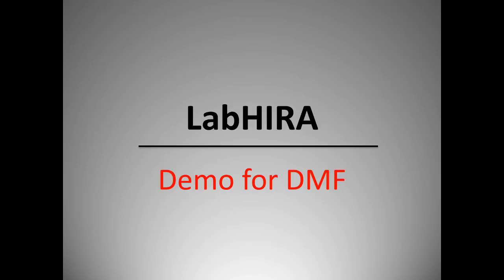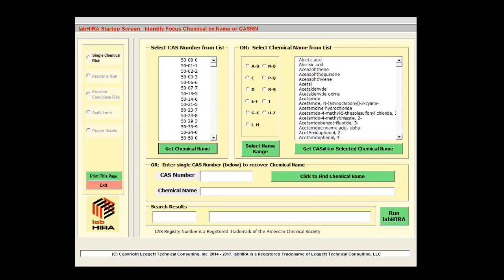labHIRA pulls all that together, and to show you what I mean, I'm now going to run a demonstration of labHIRA using dimethylformamide as our test. So this is the opening screen for labHIRA, and you can see that it's composed of 2 pull-down menus. This one here is for CAS numbers. If you know the CAS number, you can select it off this list. This is for selecting from the name, and then you can actually type in the CAS number here if that's the way you want to go.